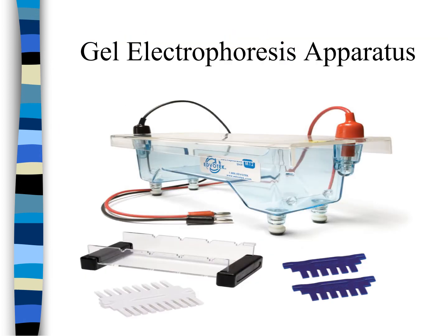So let's say we add our samples to the gel and we start the machine. I'll show you later on, we add our samples inside the holes, the wells, near the negative electrode. This is the negative electrode, the cathode. It is black. This is the negative side. We add the samples near the negative side because our DNA is negatively charged, and then the DNA will move toward the anode. The anode is the red, which is positively charged. We leave it there for a few hours until the DNA has moved down the gel.